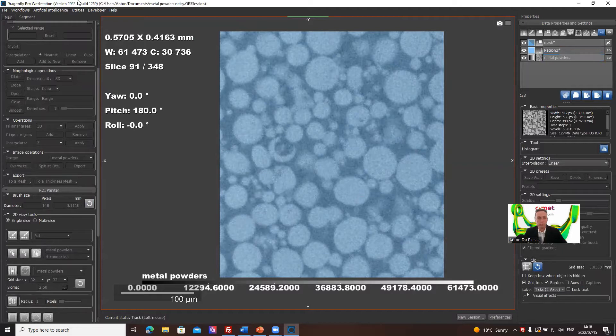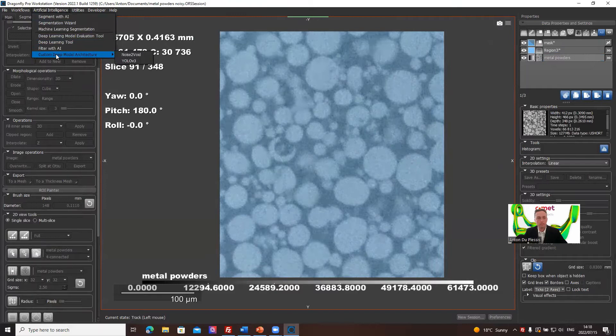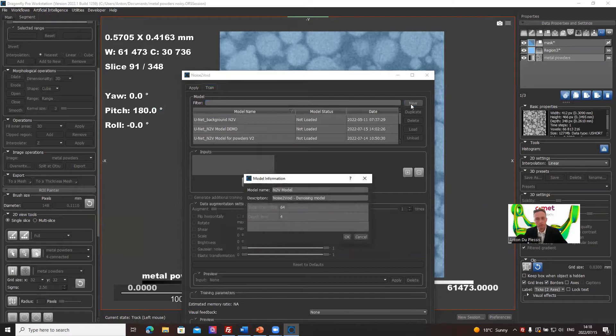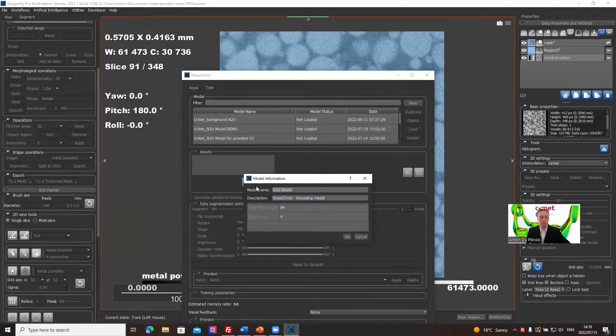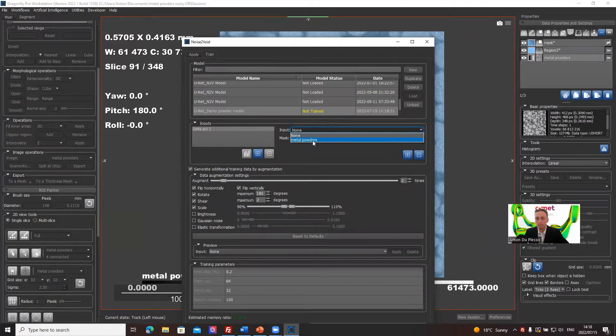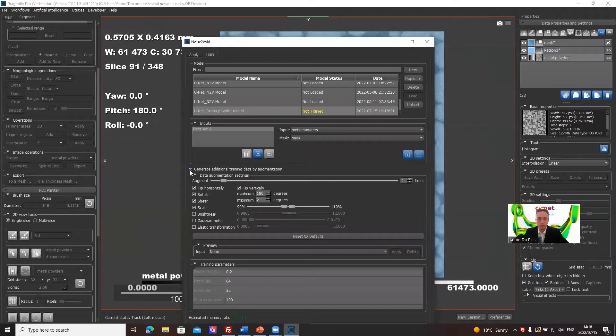And what we're going to do now, we click on the image channel, go to artificial intelligence, custom defect, deep model architecture, noise to void. We're going to go, we don't want to apply an existing one, we want to train a new one. I'm going to click on new year. This is the typical denoising. Let's call it demo powder model. We've got a demo powder model which is not trained. Input is the metal powders. The mask is the mask which I've just created.